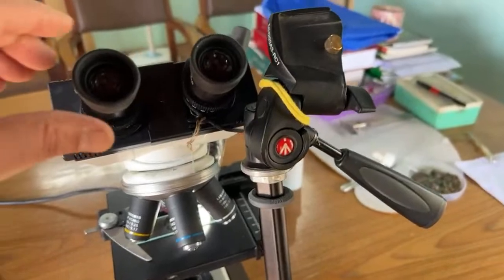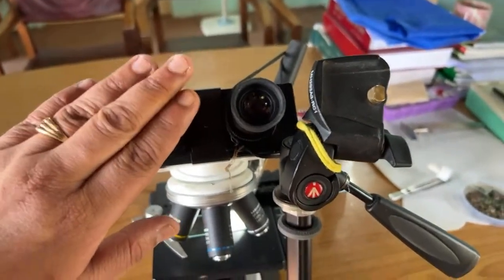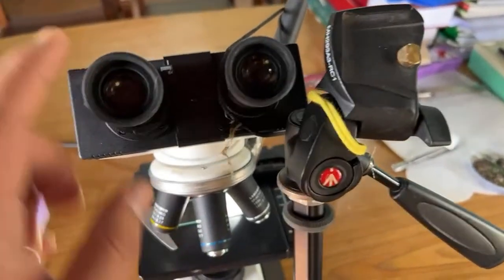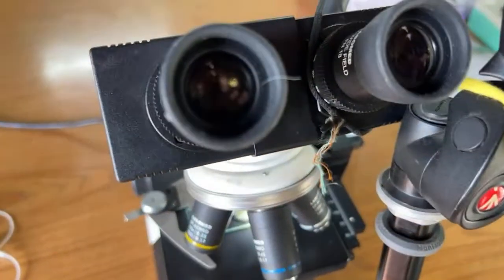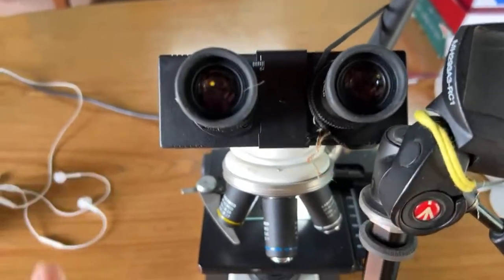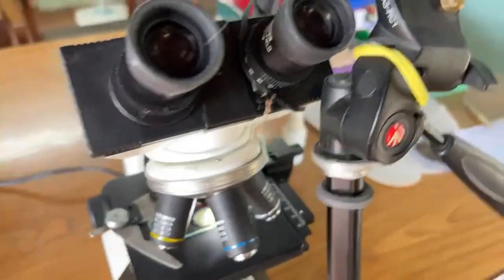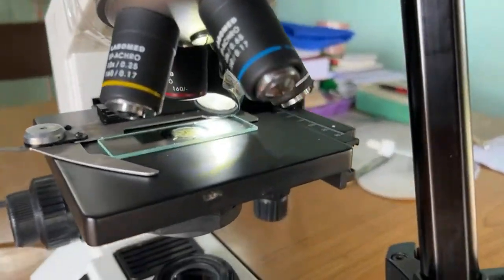So my next target is to shut this down, close it off, so that there is the least amount of light pollution, and maybe we'll come across some better views next time.